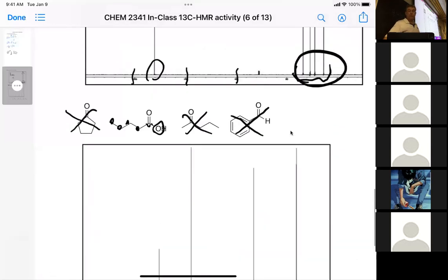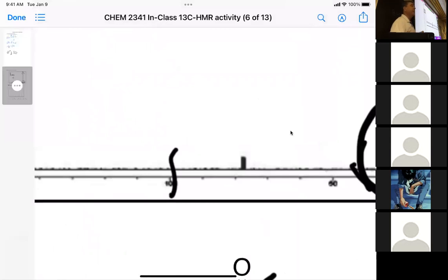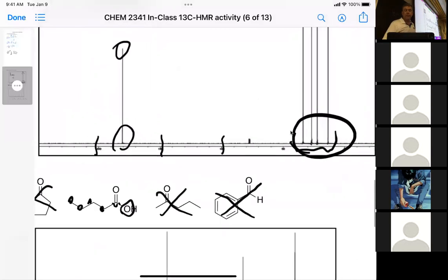Yeah. That little tiny peak. That's the solvent. It's chloroform. It's 3 peaks and it's right at 77. Usually, I wouldn't want you to think that that's a peak. There'll be little teeny tiny things of impurities here and there, but this happens to be the solvent.